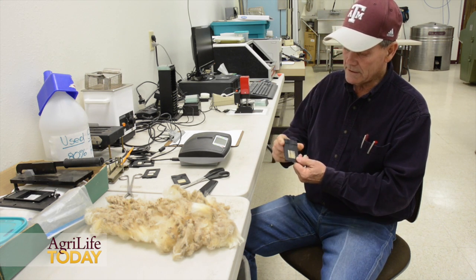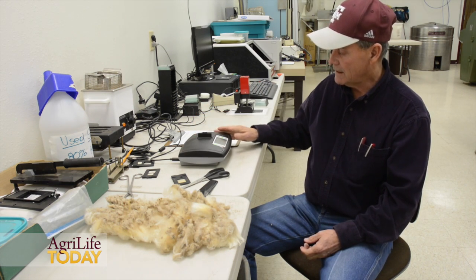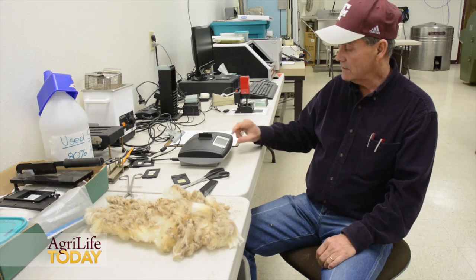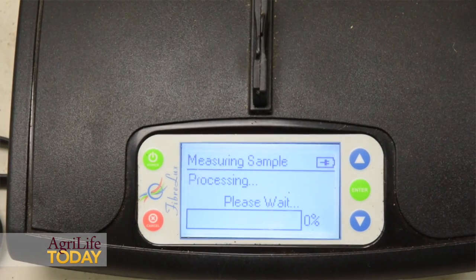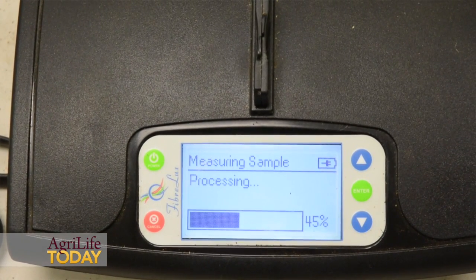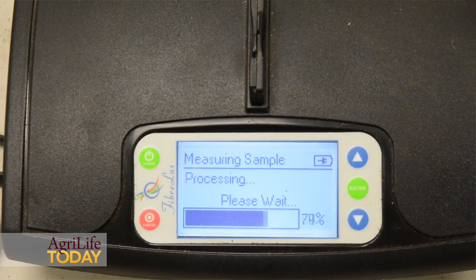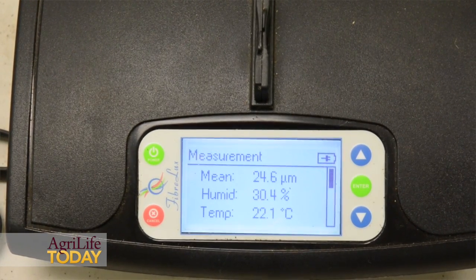Once you've got the sample prepared, you slide it into the slot where the optics are and just press enter. It'll take about 20 seconds or less to get a reading that calculates the average fiber diameter of this particular sample.